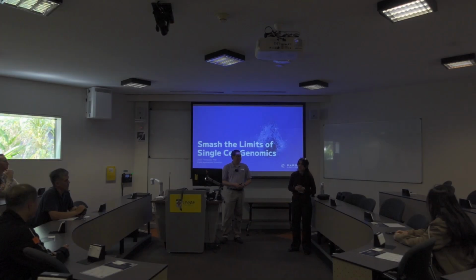Single-cell, Parse Biosciences and Scale Bio Quantum Scale, but today we are excited to focus on Parse Biosciences' application.